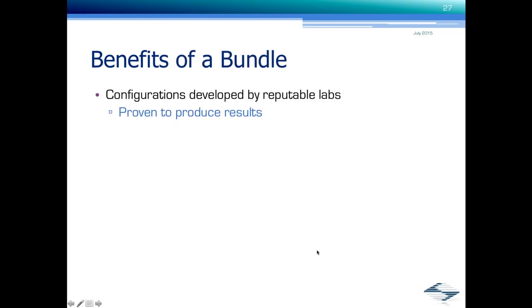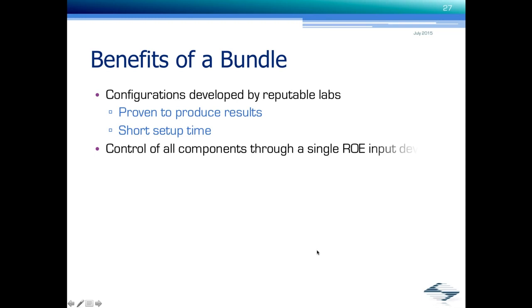What benefits do bundles have for you? The configurations that we offer were developed by reputable labs. That means they are proven to produce results. Do not misunderstand that as guaranteed to produce results, and no, the bundle will not write the paper for you, but it'll make for a much shorter setup time.